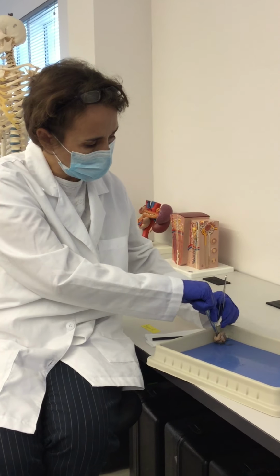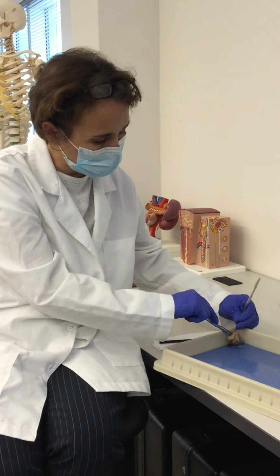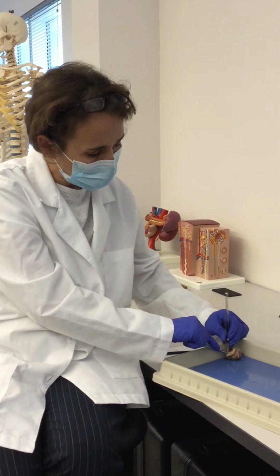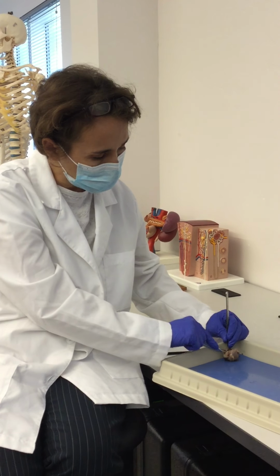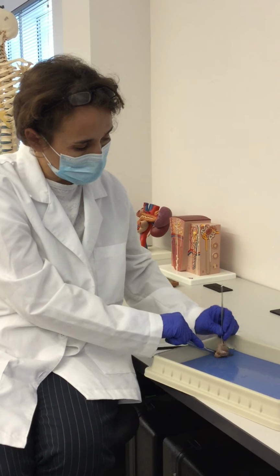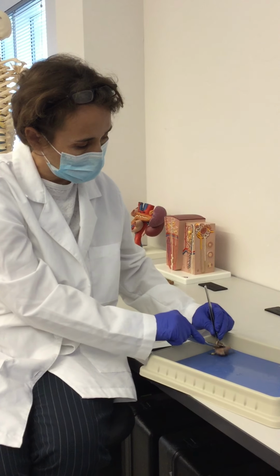Like I said, it's much easier when you're holding it with your fingers, but it is not advisable. The last thing that you want to do is cut yourself, especially with the scalpels, because these instruments are very, very sharp.